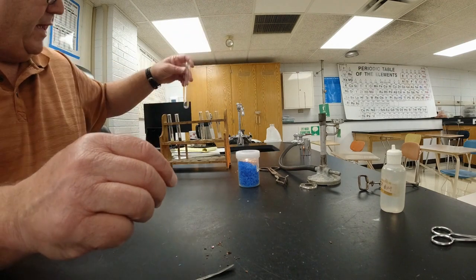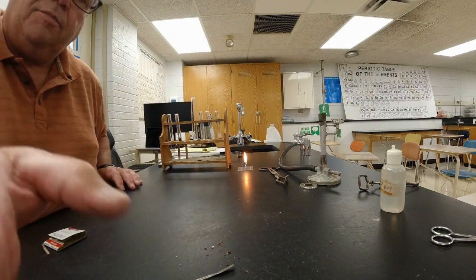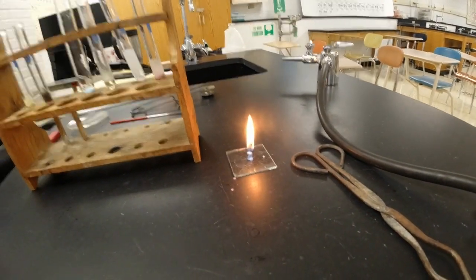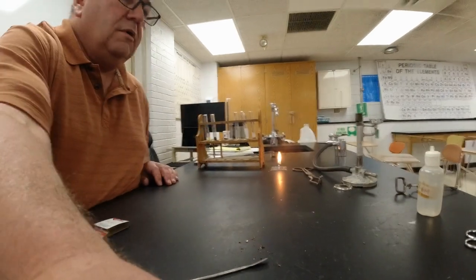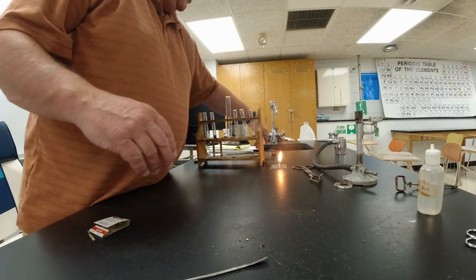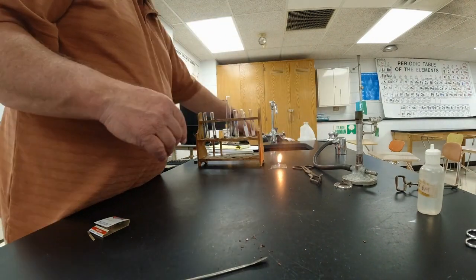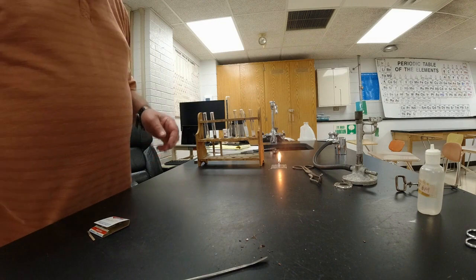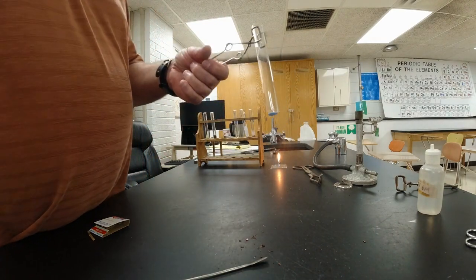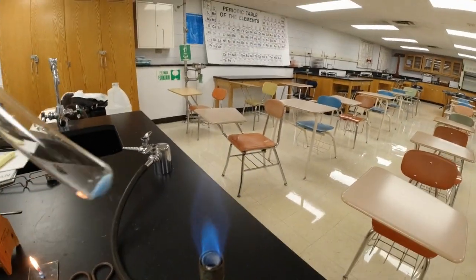Now, what I'm going to do with that, I'm going to set this in here, and let's take a peek at our candle here. Almost gone. All right. So I'm going to need the Bunsen burner again. And I'm going to grab this test tube with the blue crystals in it, the blue powder in it, and I'm going to heat it.